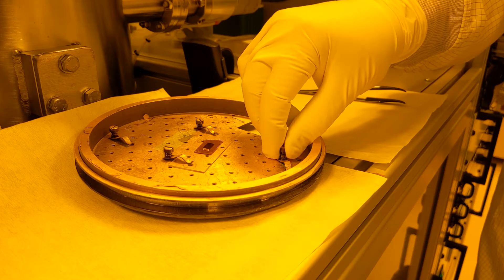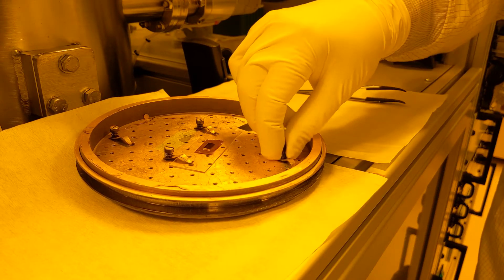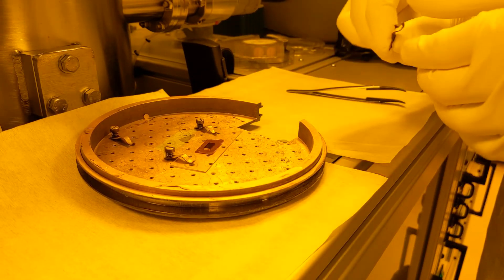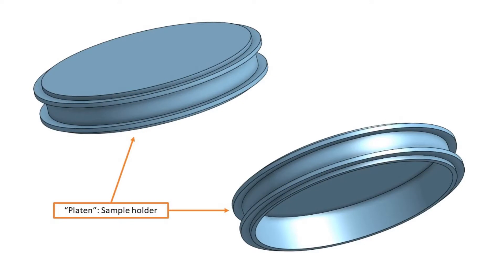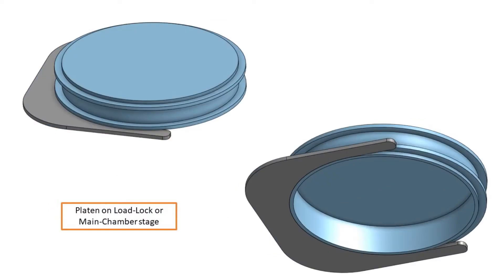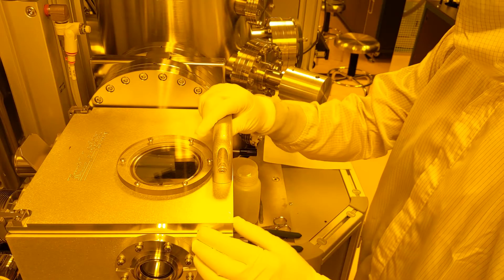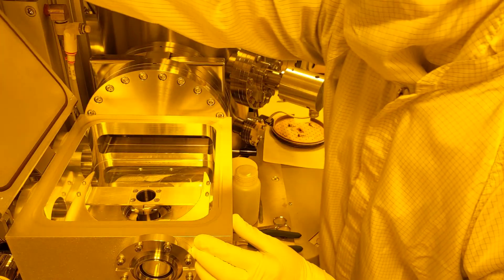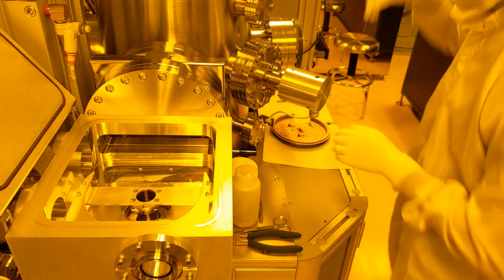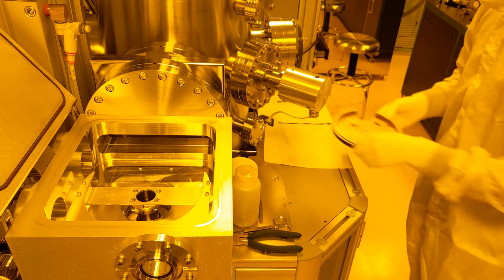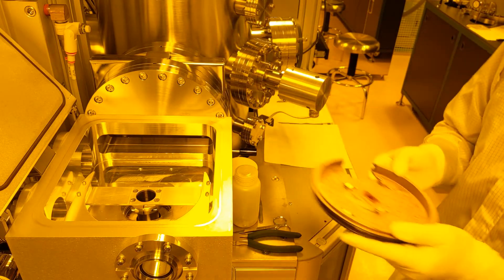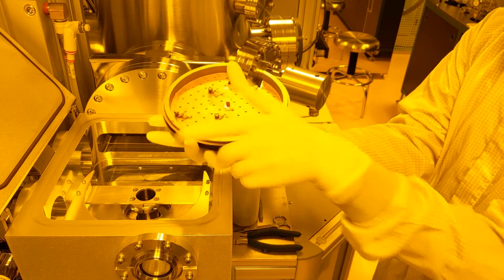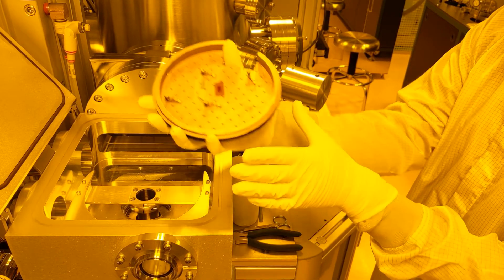Before we put the platen back onto the stage, let's look at how it sits on it. This is the platen and as you can see it has a little edge on top and bottom. Here we can see how it rests on the actual stage. Be sure to place it on as shown here or you will make the transfer process difficult or impossible. Place it on the stage in the load lock with your sample surfaces facing downwards.